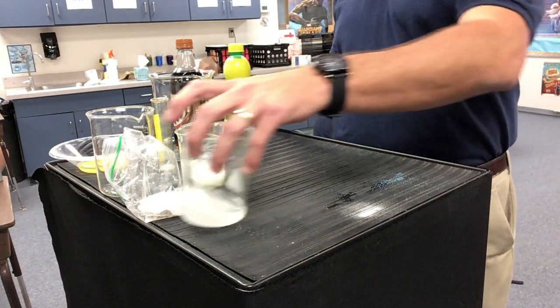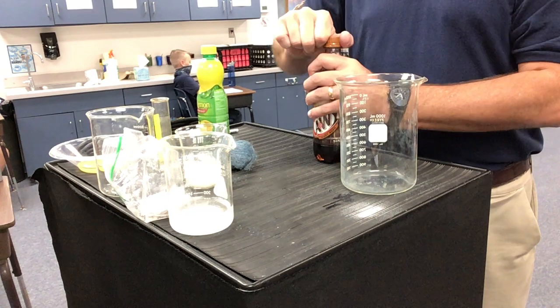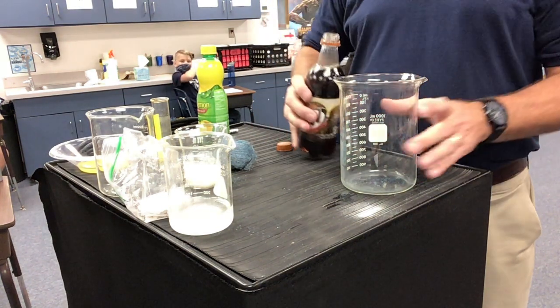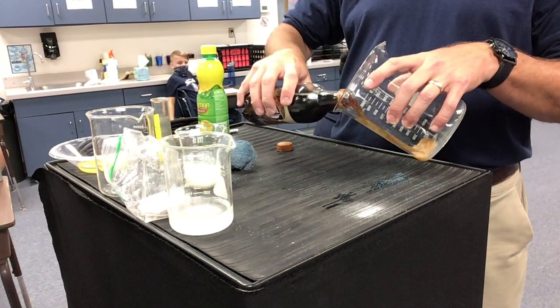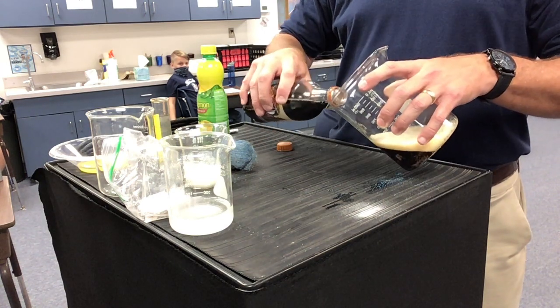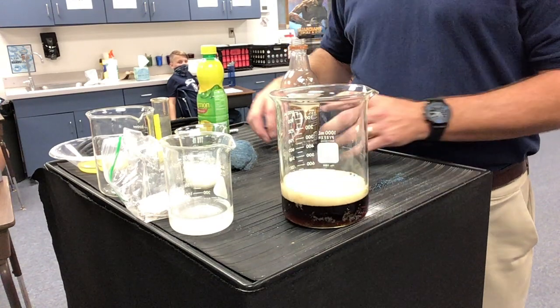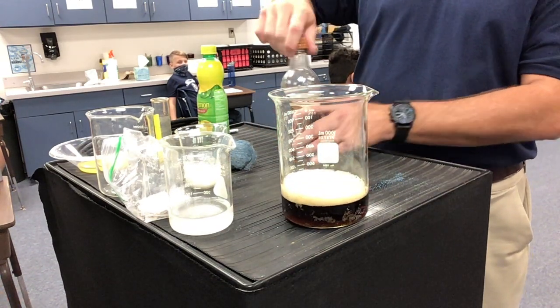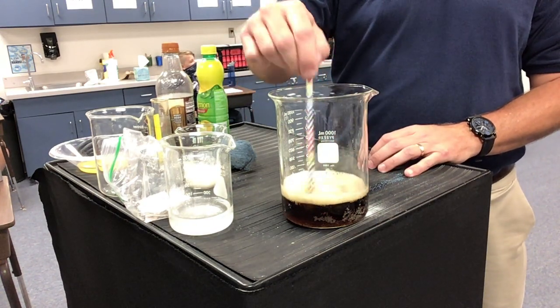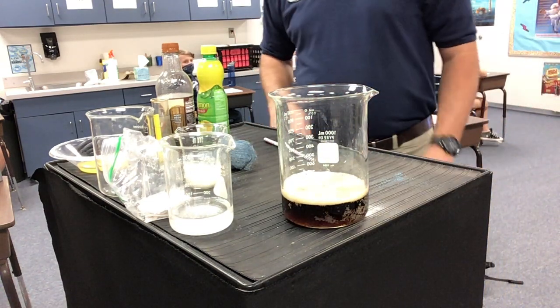Last one. Taking a soda. Now some of you are saying, oh, it's making bubbles. No, there's bubbles already in there. They're not making anything. Those bubbles are already there. That's just because I poured it. So I'll kind of let those bubbles go down.